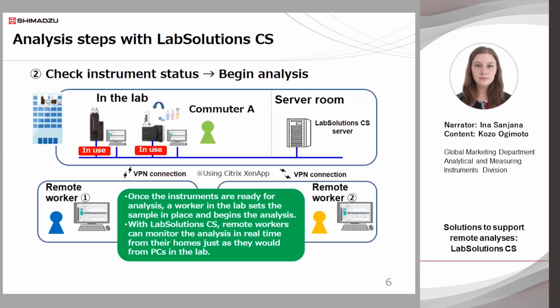However, to avoid causing additional problems, it's recommended that workers in the lab should normally be the ones to carry out direct operations, such as pausing or restarting analysis.